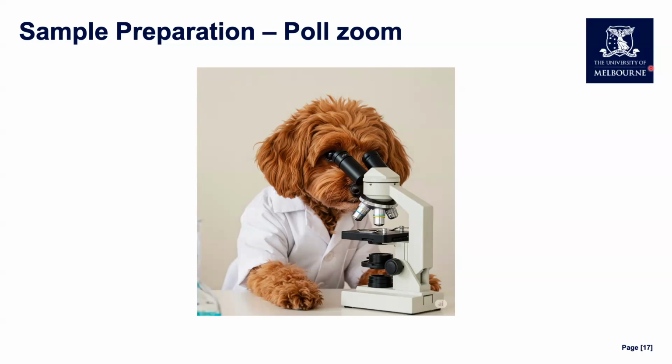The second question is, what should you take care over when choosing an antibody panel? The correct answer here is that your secondary antibody should target the species that your primary antibody was raised in. So that's the second question there. And again, a large proportion of you guys got that answer correct, which is good to see.